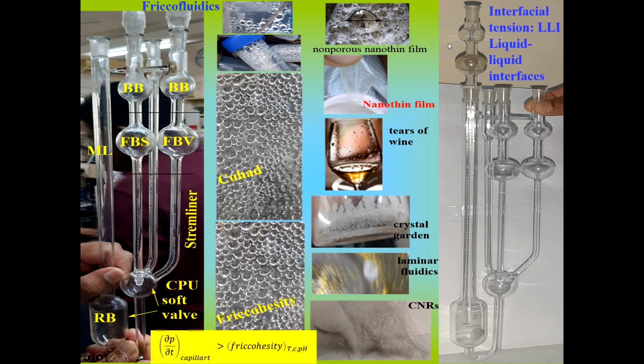And this device, now I am quoting this example. See this phytochemical. No surfactant is added. But see, this non-porous thin film, nano-thin film is developing. This survismeter also takes into account such potential features of your nanoemulsion. And now see, this is like a graphene thin film, a nano-thin film in between.